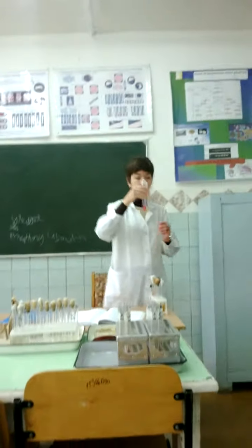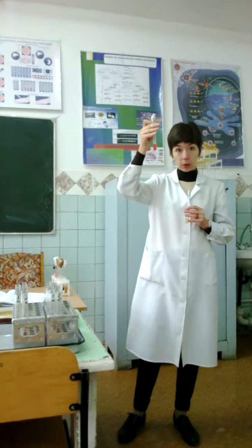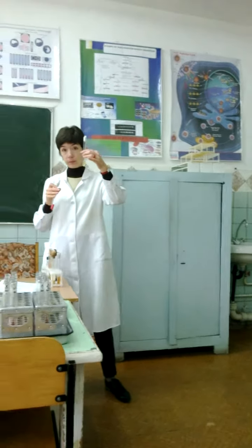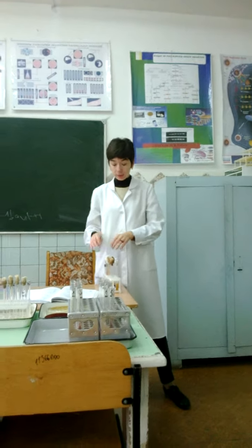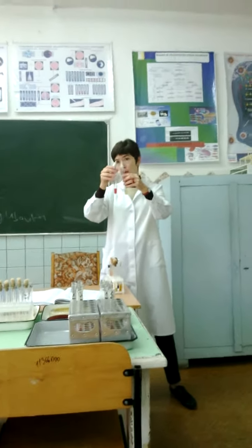It's positive, also with pink color, from formation of acetyl methylcarbinol. It's positive for El Tor Vibrio cholerae and negative for classic Vibrio cholerae. Is it clear? It's also a biochemical test, similar to the test for starch.